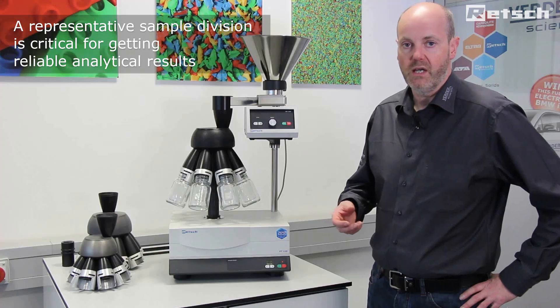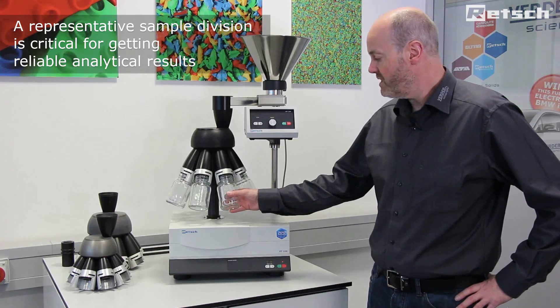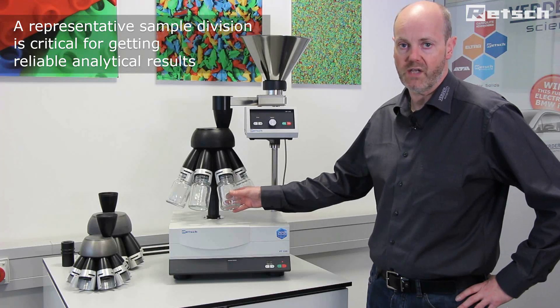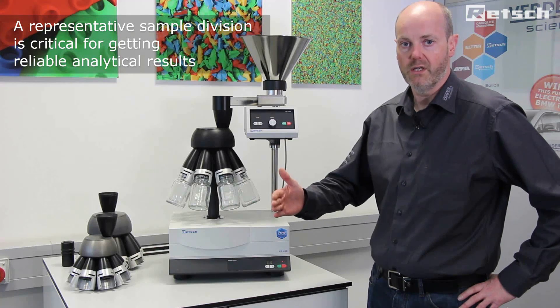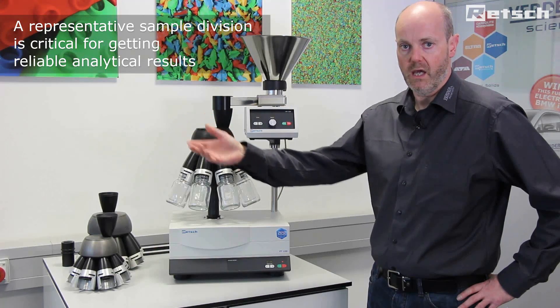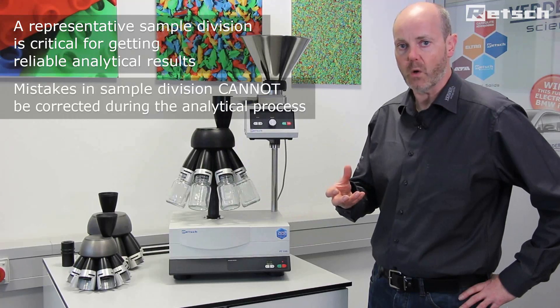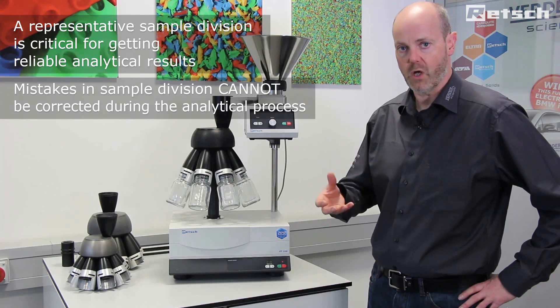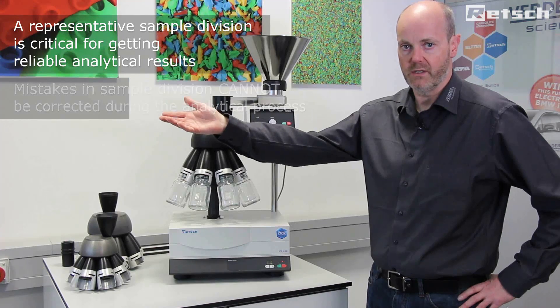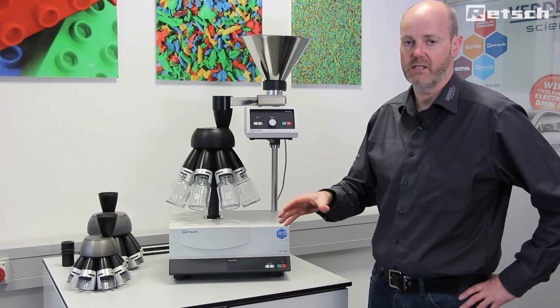Representative sample division is critical in order to get a representative subsample from bulk prior to preparation of the sample, to take forward to any process whereby we end with an analytical result. If we don't take a homogeneous representative sample from bulk at the beginning, this result cannot be rectified later in the analytical process. Therefore, it is of critical importance that this first step is done correctly.